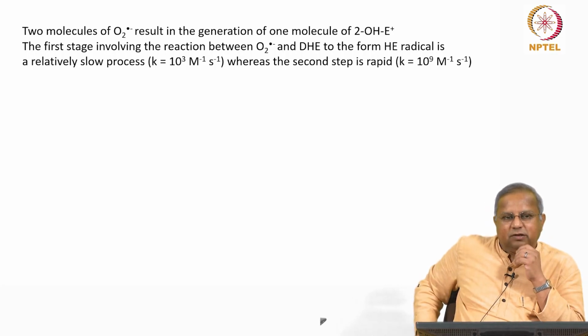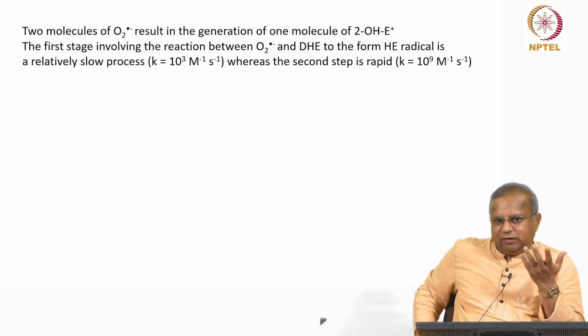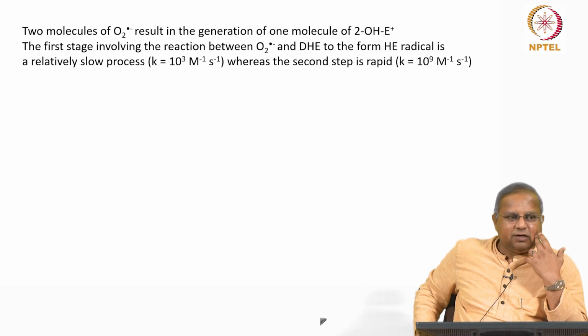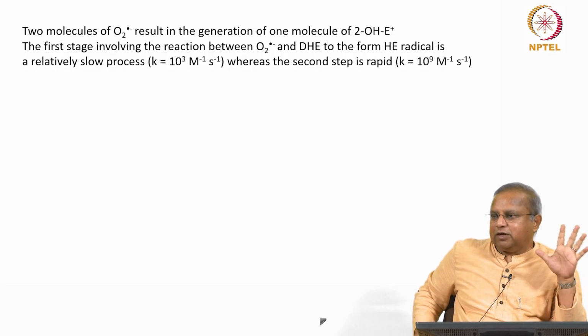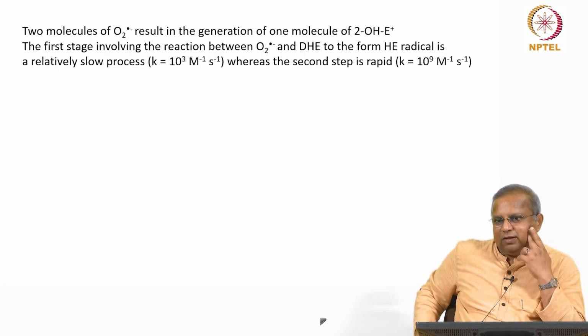Okay. For a very long time, we were using KO2, potassium superoxide. It's a reasonably stable salt, a rare stable salt of oxygen. And you just put it in water. There's a stoichiometric amount of superoxide that's generated. Okay, no problems. We've had very straight standard curves right through.